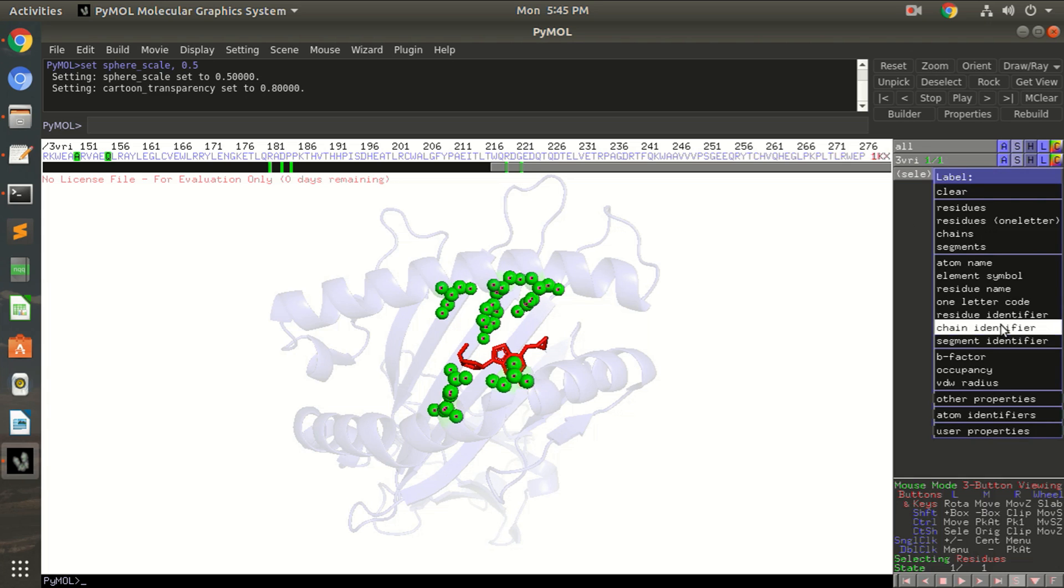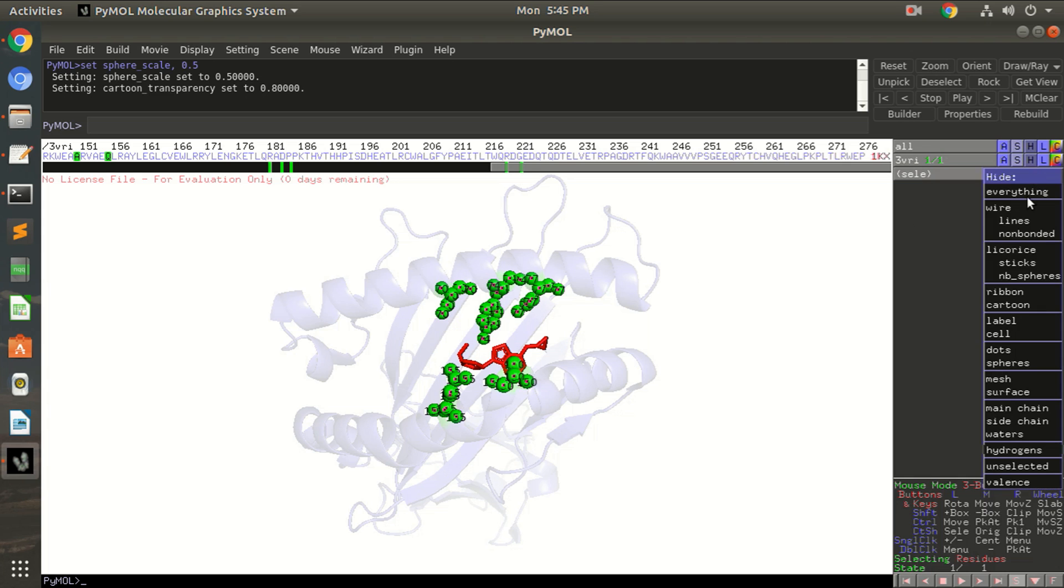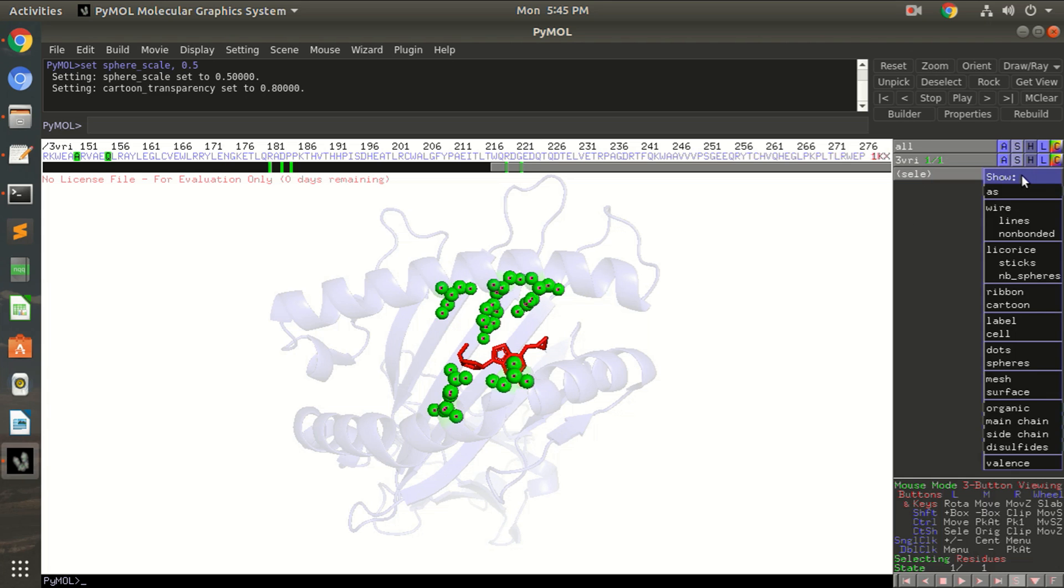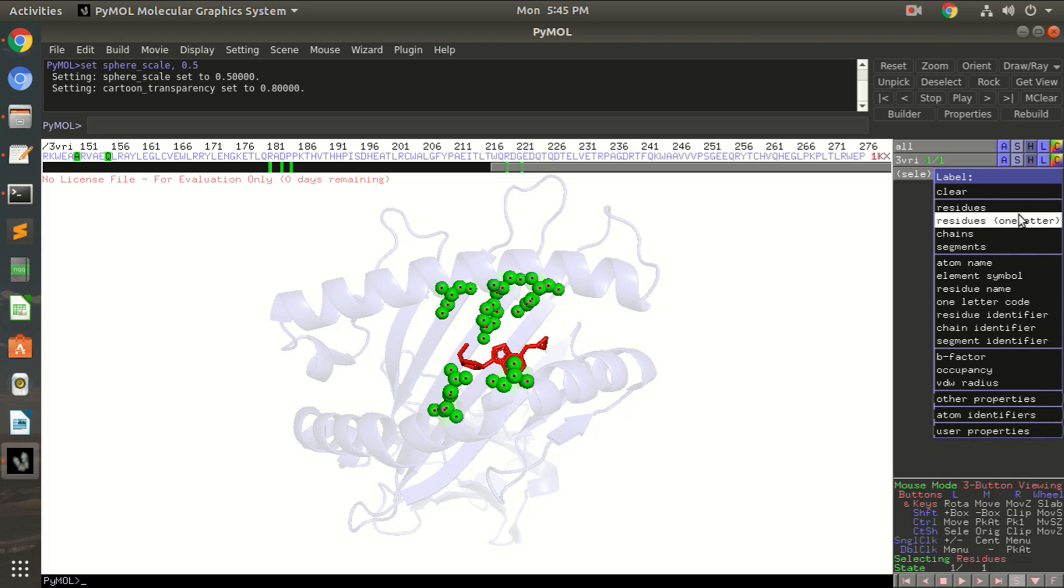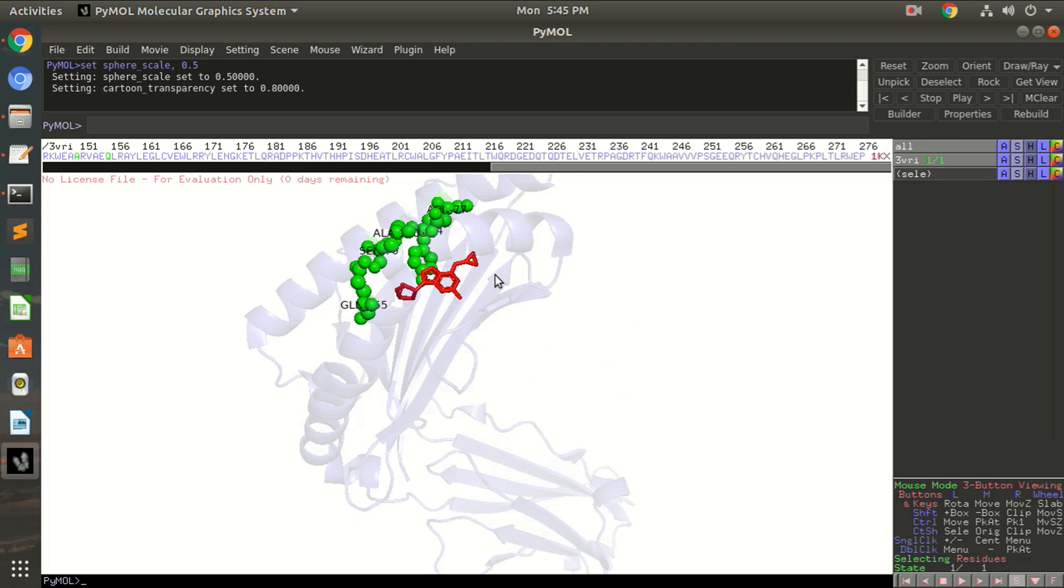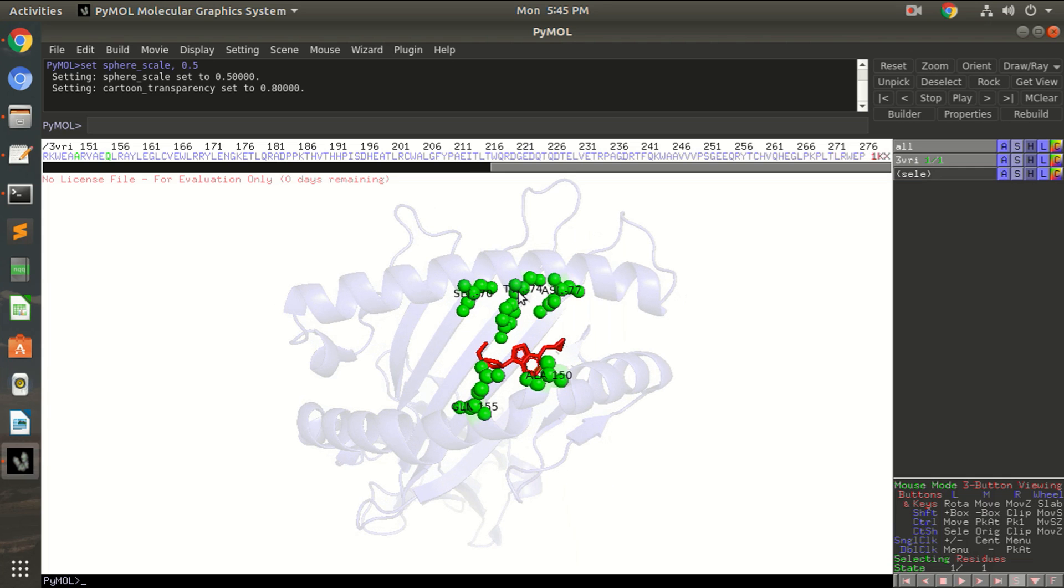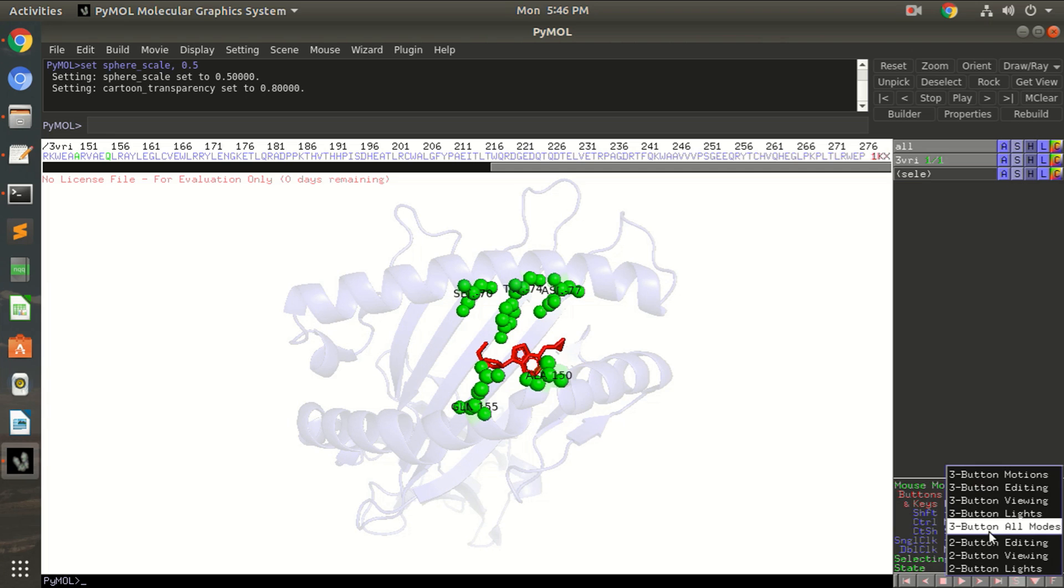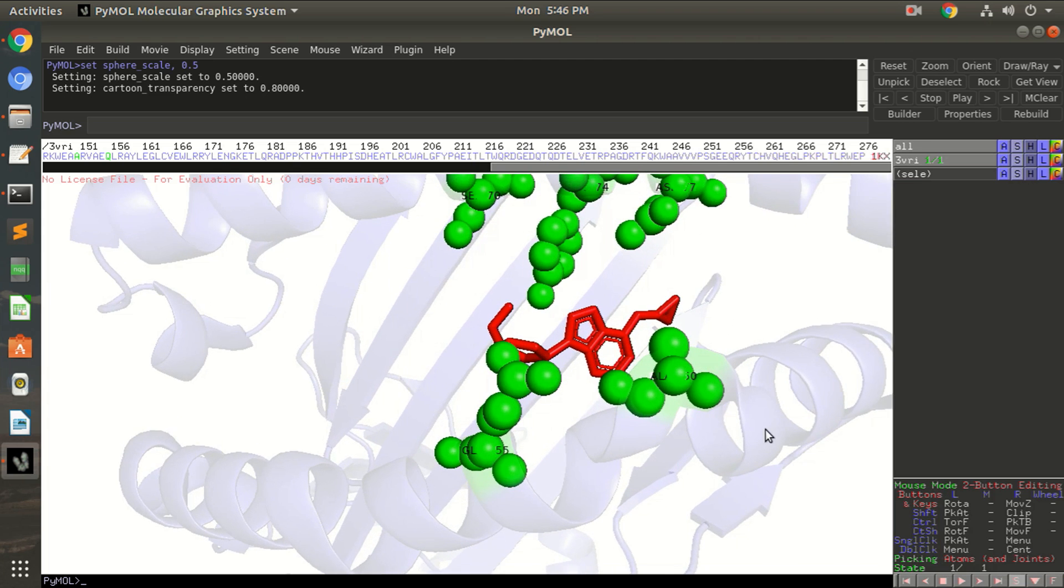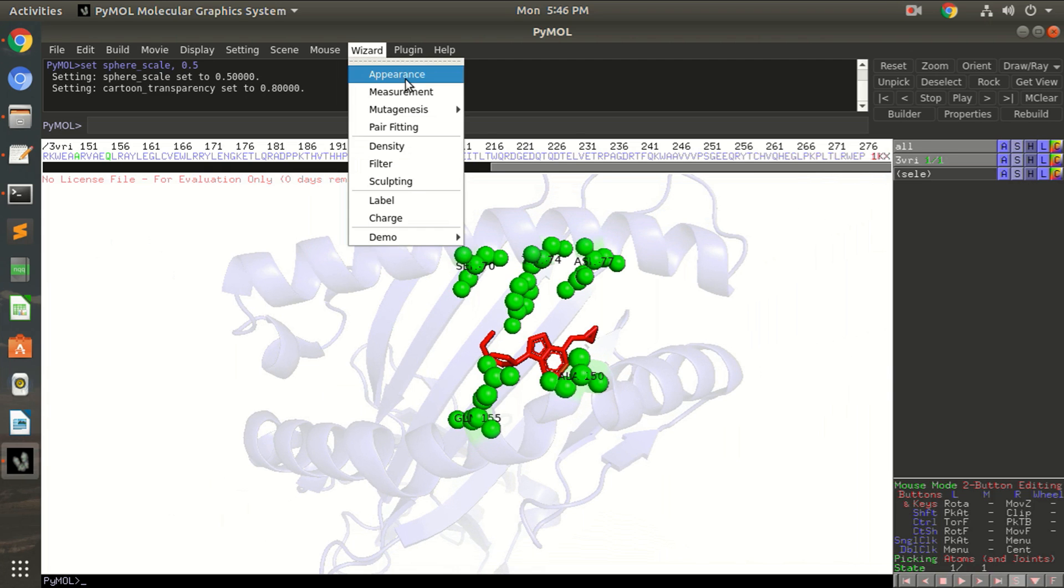Okay, or you just want the one letter code, so it depends on you. So I am going to label it as label residues. Okay, now you can see the residue name is not clear because it's getting hidden behind these spheres. So the other option you have is you can move the labels. Go to this panel that is at the bottom right and left click to button editing mode.